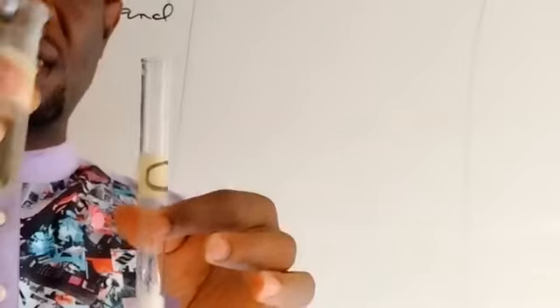So this is C. You can see written there: white crystals, C. I'm going to open the test tube and add water to C. Collect a reasonable amount of water and add up to more than half, about three quarters of the test tube. You're not measuring the water, just add a reasonable amount of distilled water.